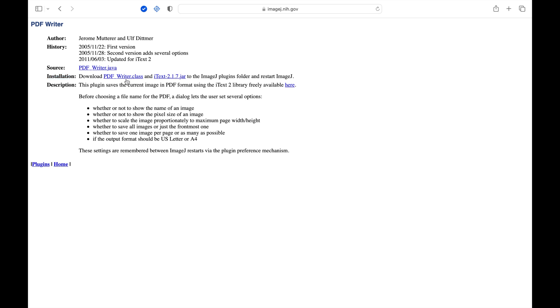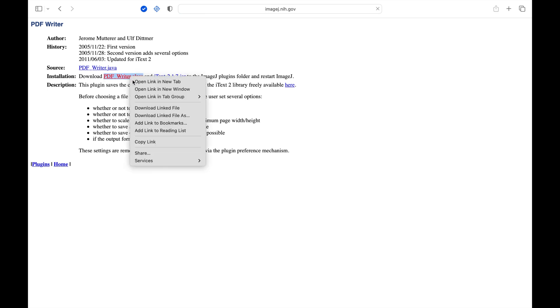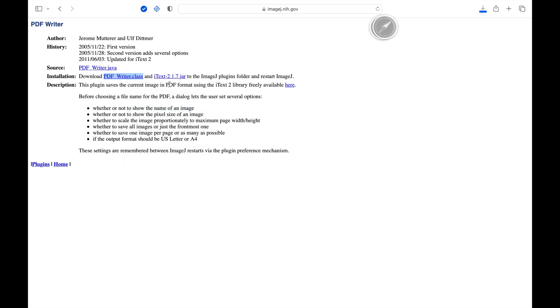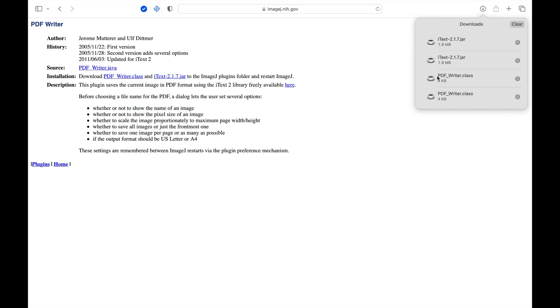You can download it by simply clicking on the link or make a right click and save it. Once the downloads are completed, it is time to install the two plugins.